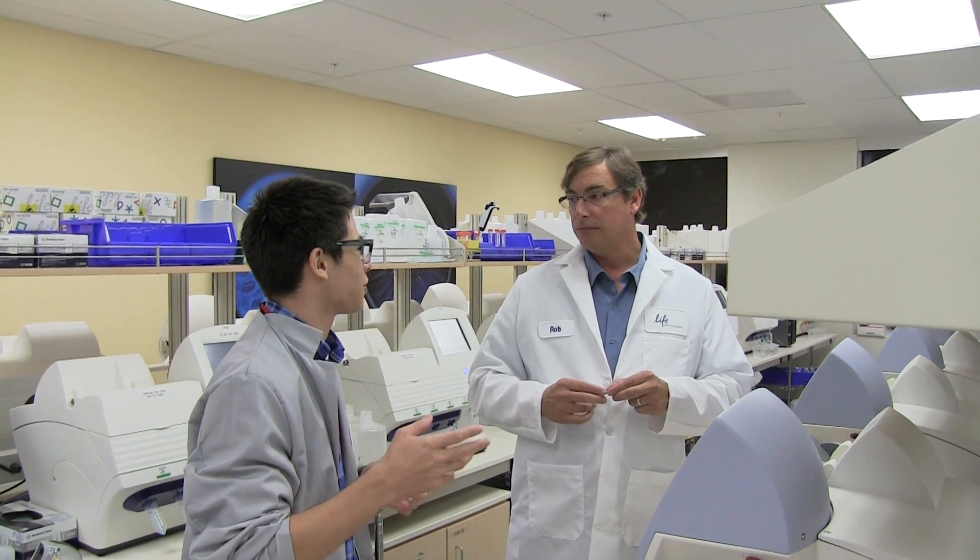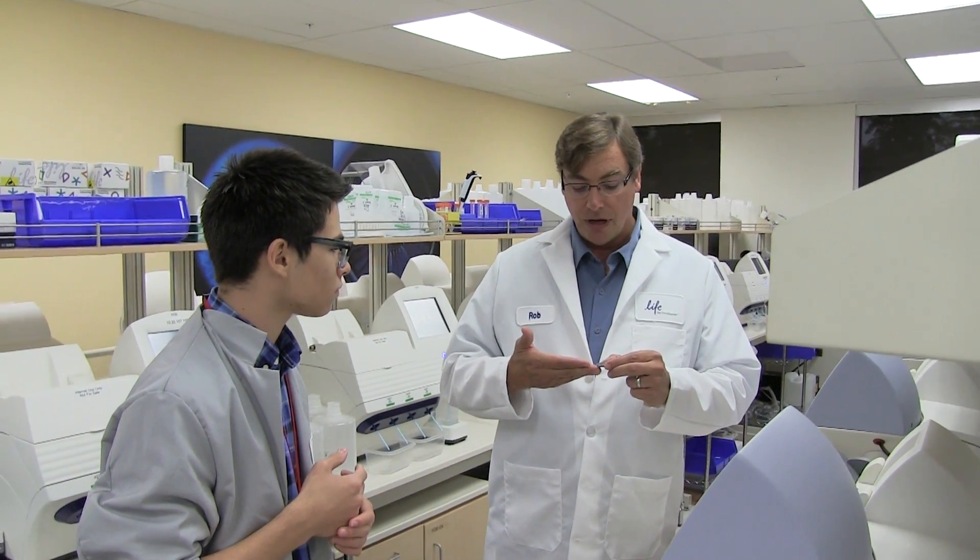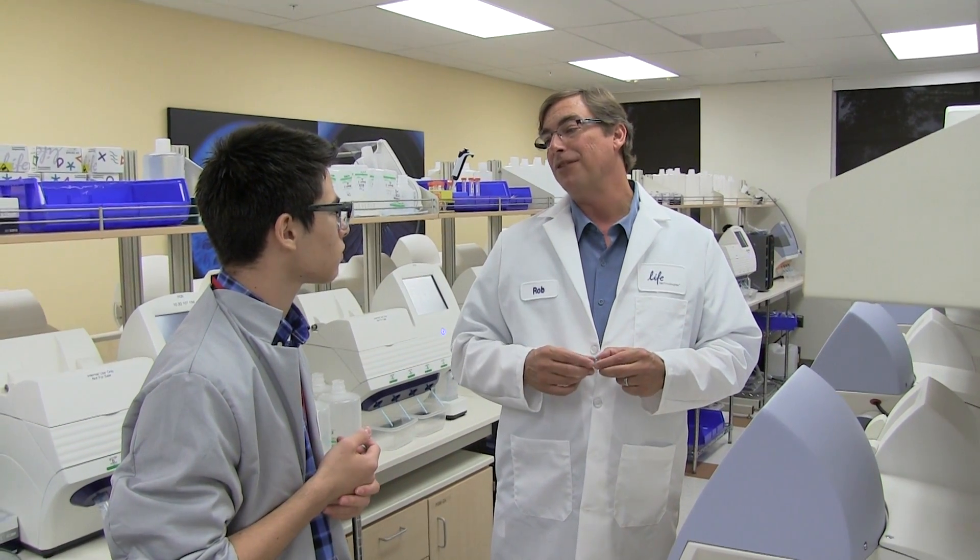The software is definitely complicated. It's a system that brings together many different disciplines — molecular biology, chip architecture, and software engineering. It really takes a lot of different expertise coming together to put together a system like this.